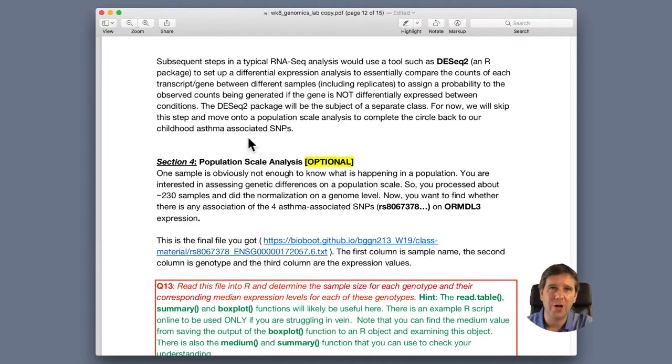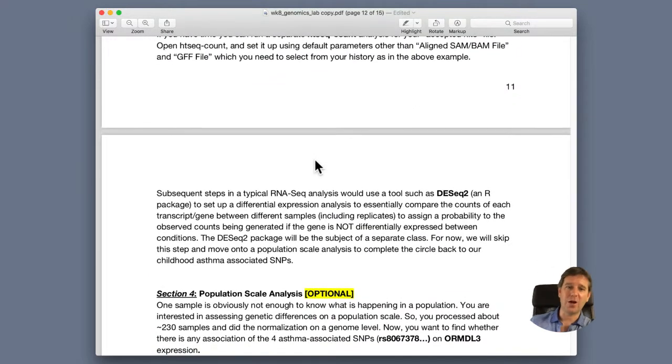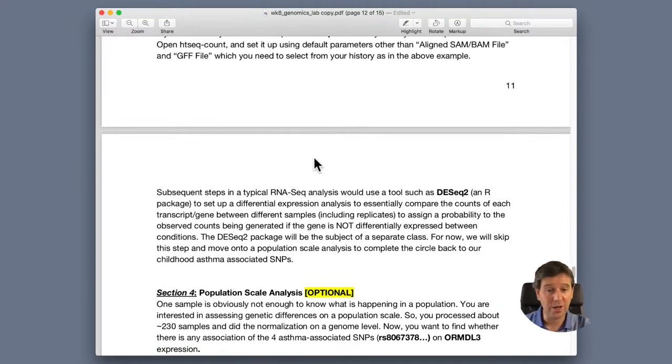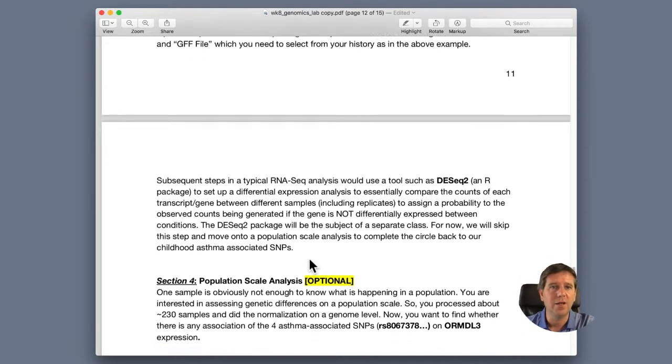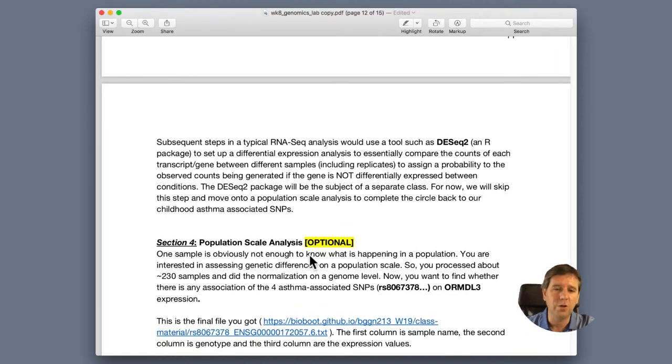Okay, so here we are back. So the next steps overall in taking that count data would be to do a differential expression analysis. We're going to do that in R next day. That'll be where we take that data and actually analyze it. If we have a drug present or not present, or a disease condition, not disease condition, these kind of tests we'll look at next day.